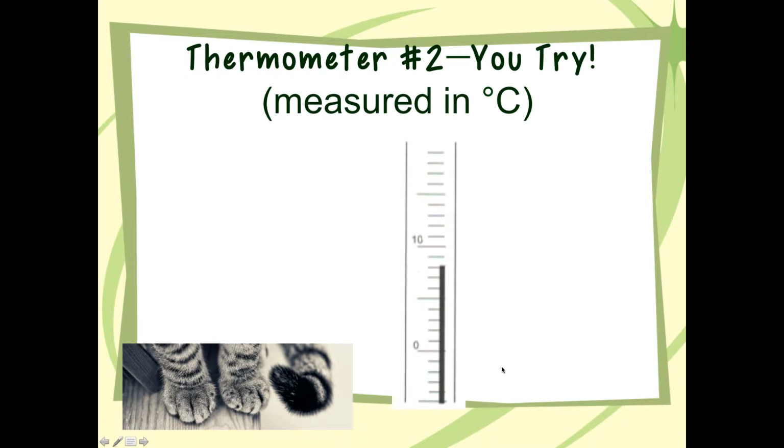All right, welcome back. Let's see if I agree with you. So still going up by one. So 0, 1, 2, 3, 4, 5, 6, 7, 8. That we're able to count, but it looks like it's a little bit past that 8. So we might say 8.1.